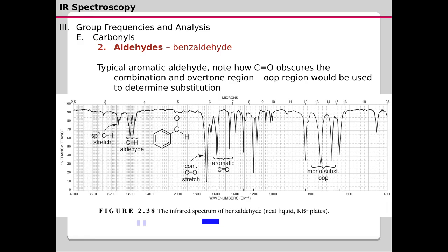You can deduce that this band, this doublet structure, is due to the stretching vibration of the CH functional group here, and this is the Fermi doublet, which results because of the coupling between the CH stretching vibration with the first overtone of its bending vibration.